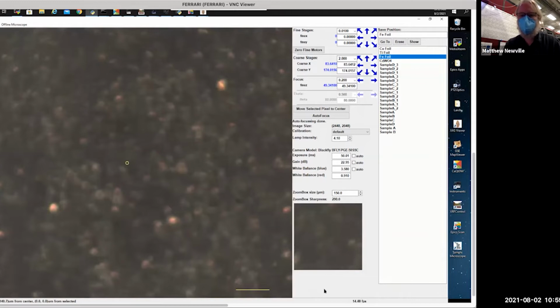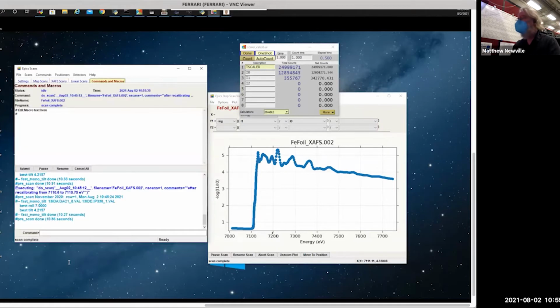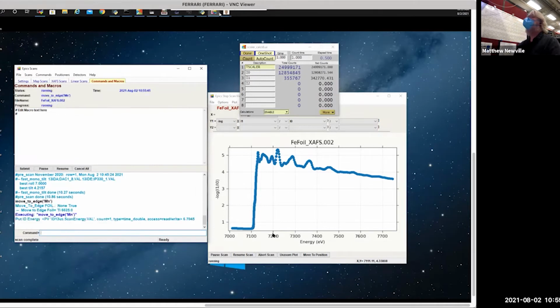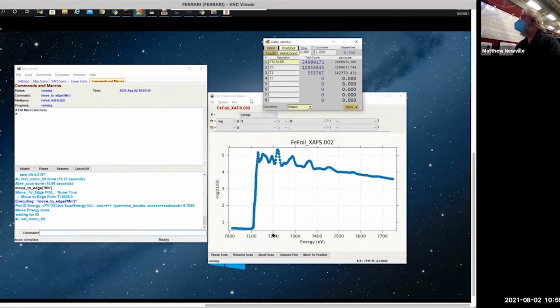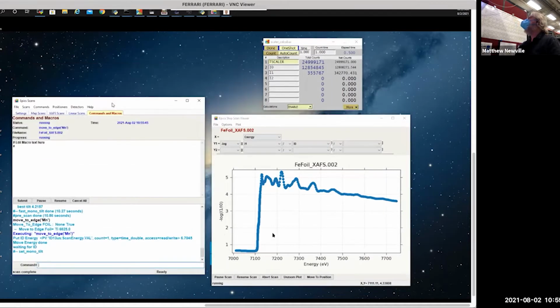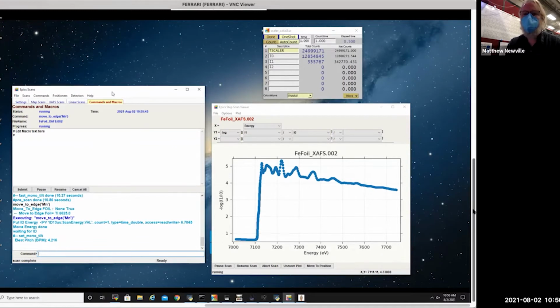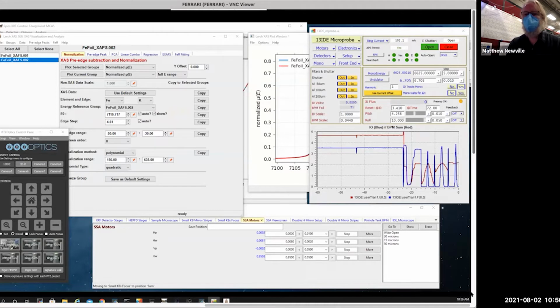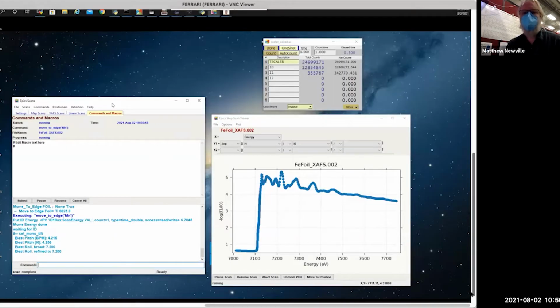But now we're going to go back to doing the same thing with the ion chambers. So I'm going to move to manganese. It's very close, but I'm just going to move this way because it's sort of easier. It doesn't really matter if we're going from only a few hundred volts. But it does this check, so you can see up here in our intensity measurements, it's checking the intensities in our ion chamber, and we have a foil upstream as well. That's the red curve. Just to see that the beam is optimized and going through all the little slits well. So it's just taking a little bit of time to do that.